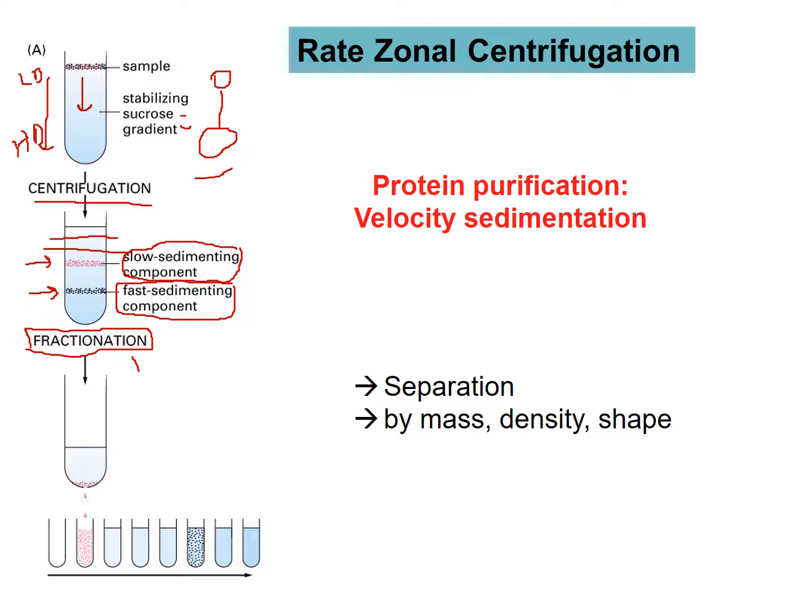And so they're showing this fractionates here, and we have some areas that don't seem to have material, and then we hit this, I'm sorry, that's the slow, this is the fast. And then we have some other. So in this very simple cartoon, we have two fractions. If this is, say, 20 mils, then these would represent 2 mil fractions.